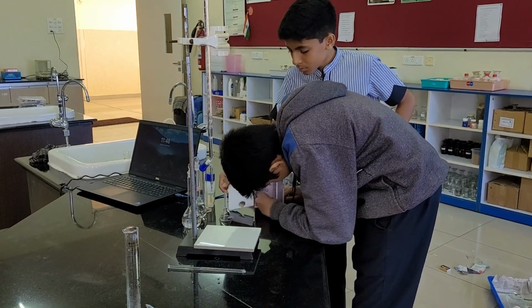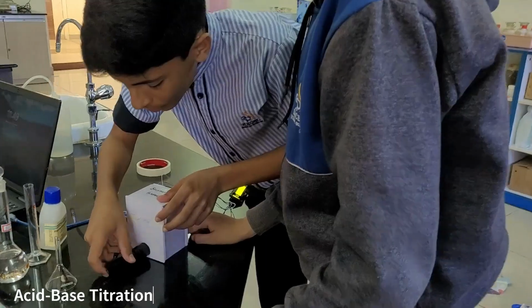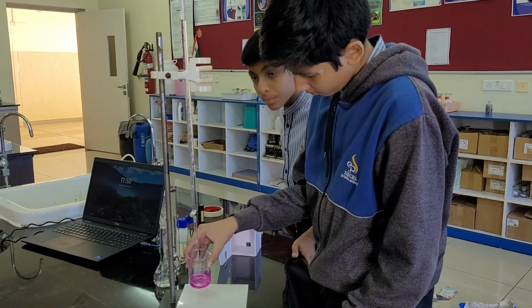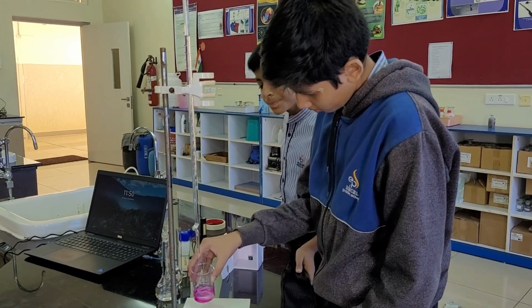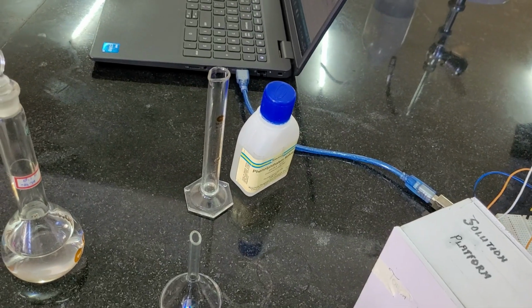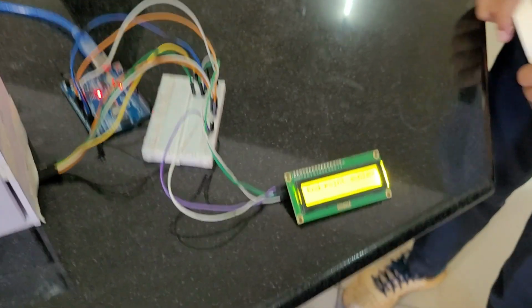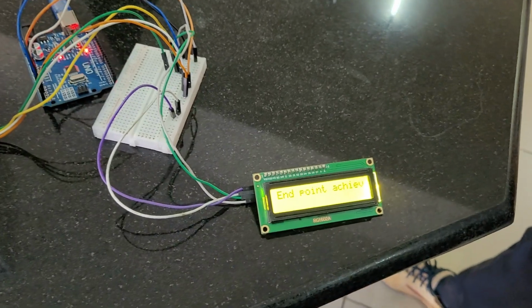Acid-base titration. Students carry out titration by using an Arduino, light sensor, and phenolphthalein. As sodium hydroxide is added to hydrochloric acid, the phenolphthalein changes color and the sensor detects the change in light intensity.